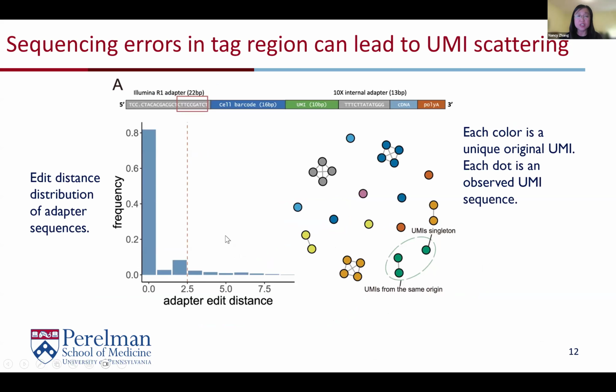Okay, how serious is this problem? At first we thought maybe it's not that serious because the errors are rare. So how rare are errors, by the way? It depends on the data set and on your actual experiment. Nanopore publishes error probabilities, but those are under ideal settings.